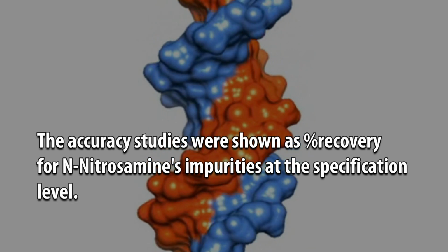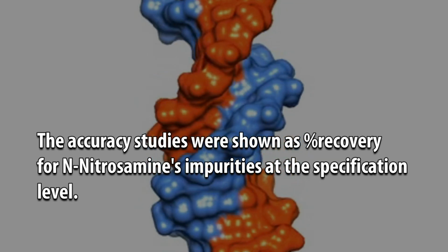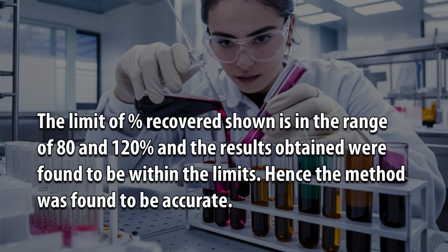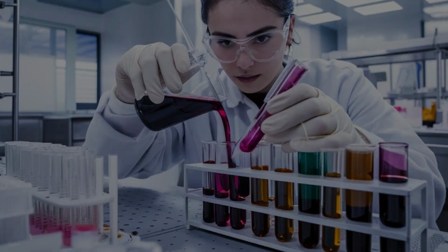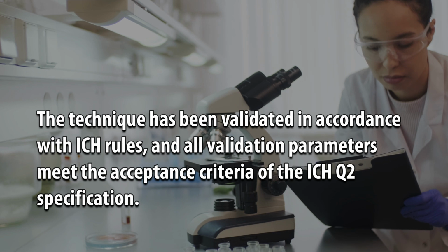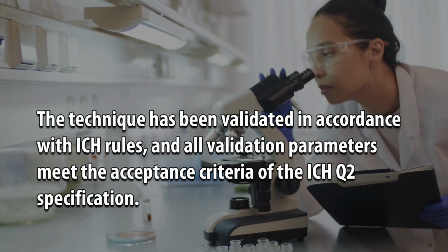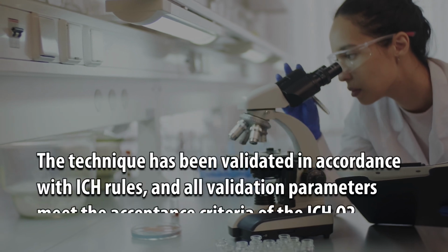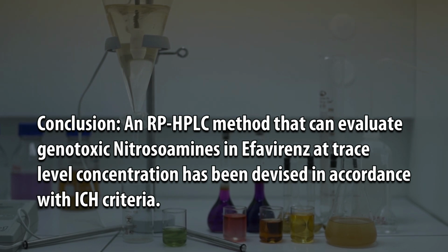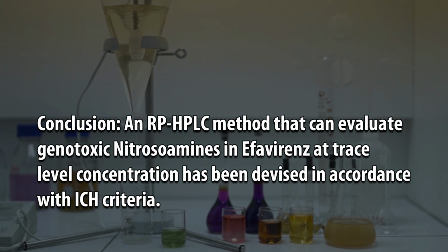The accuracy studies were shown as percent recovery for N-Nitrosamine's impurities at the specification level. The limit of percent recovered shown is in the range of 80 and 120%. And the results obtained were found to be within the limits. Hence, the method was found to be accurate. The technique has been validated in accordance with ICH rules, and all validation parameters meet the acceptance criteria of the ICH Q2 specification.